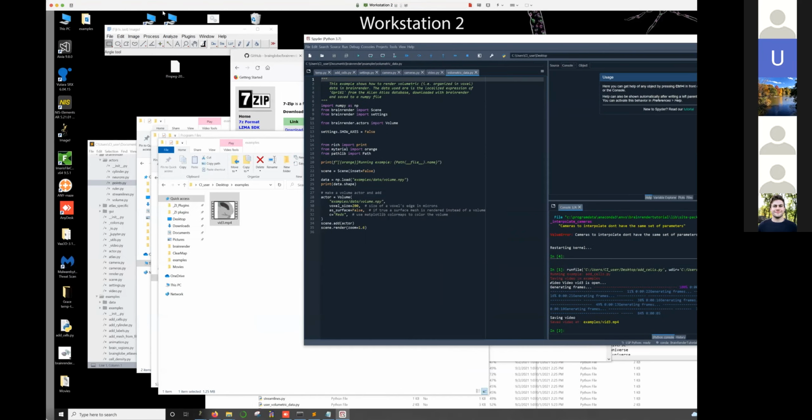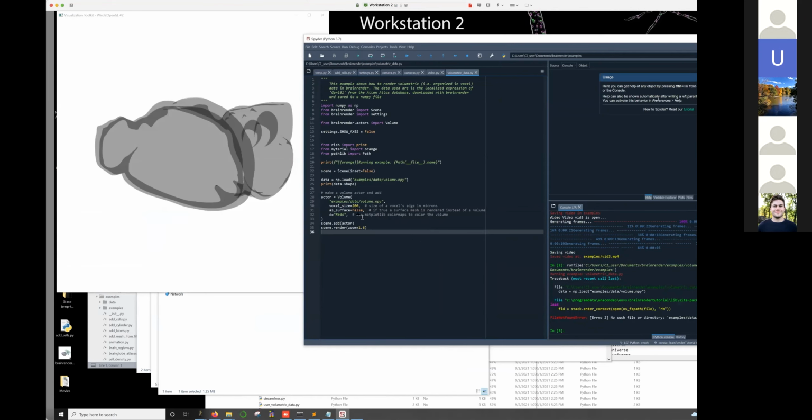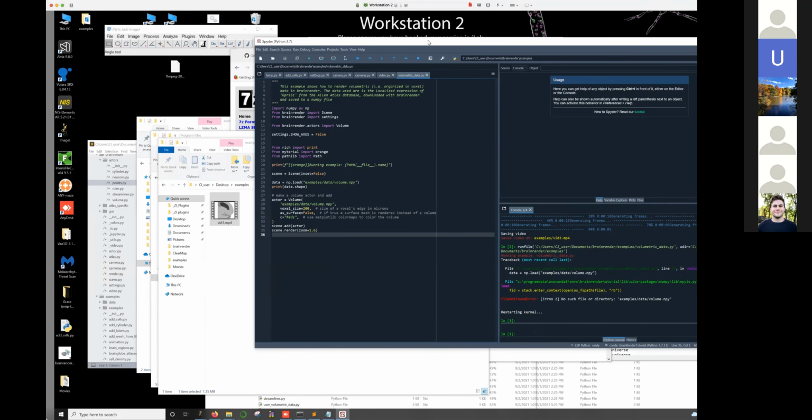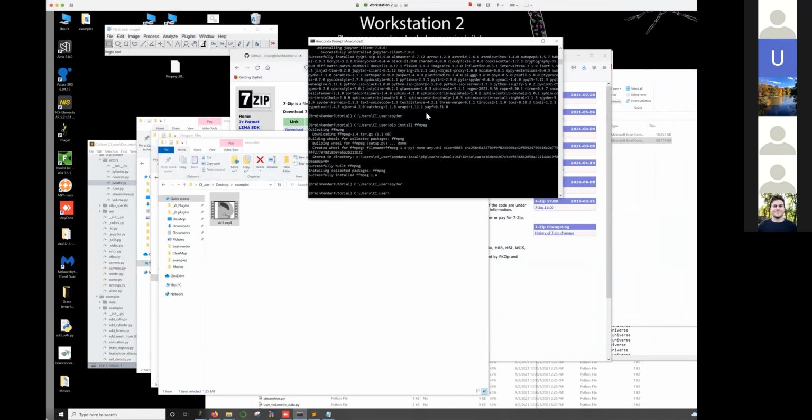And to do that, if you just have a go running this, maybe I've got the raw data only on this computer, but you can use this example raw data, which is a little bit faster to work with. This is just some low resolution data that's mapped in the hippocampus. If you're going to work with data from BrainJ, then it's actually important to install one more thing in the BrainRender environment, and that's called IMIO, which is an input-output library. So pip install.